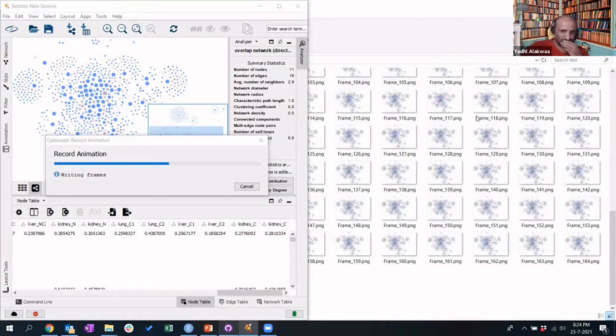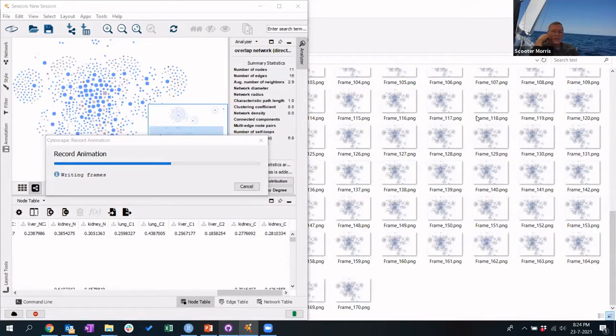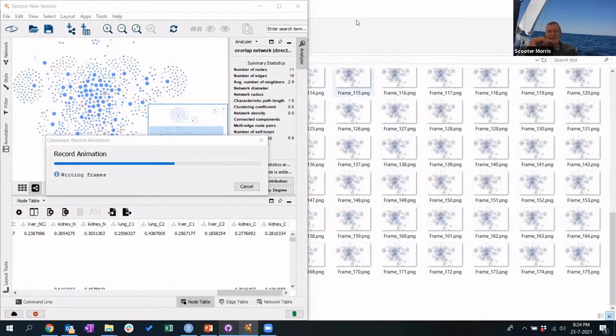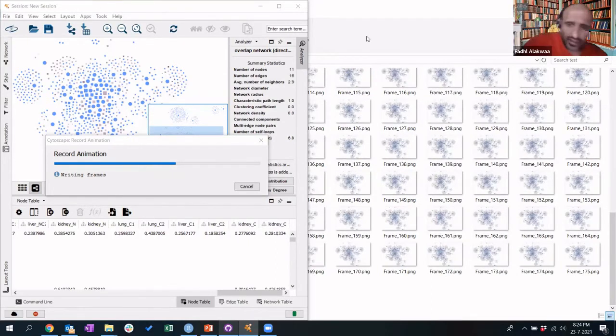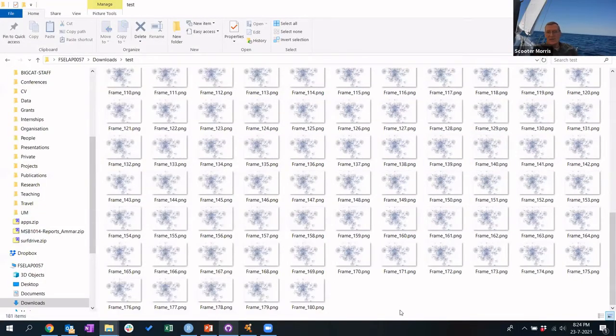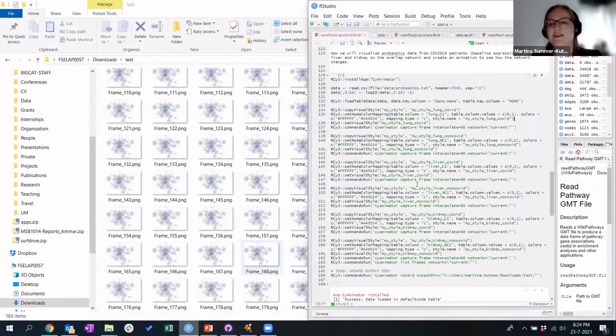I think in a lot of cases, the first thing is to try this going through it manually, and then try and script it. I'm pretty sure that's what Martina did to begin with. Yes, I did. The manual approach does have a reasonable interface that allows you to control the timing and things like that. So maybe initially I wouldn't do the 60 frames or something, but something quick to see if I can see that change, yes or no.